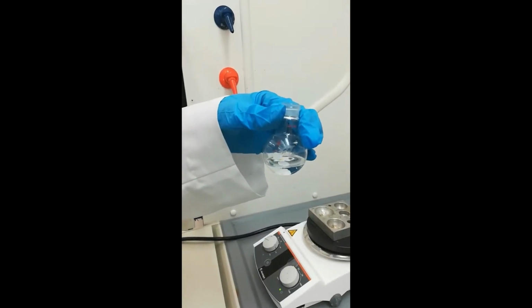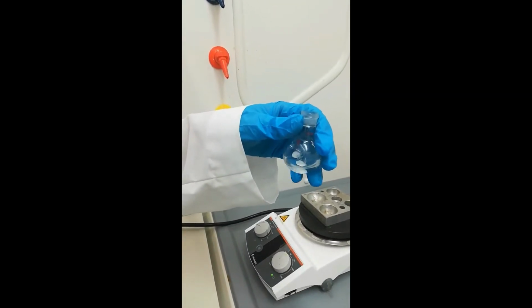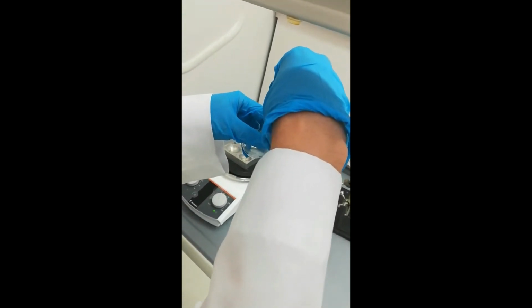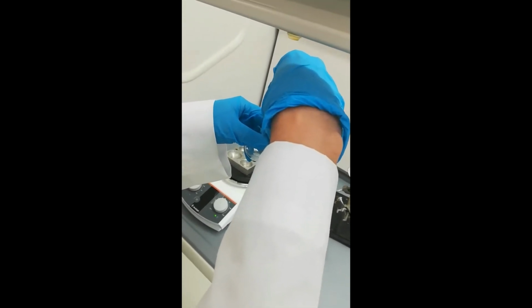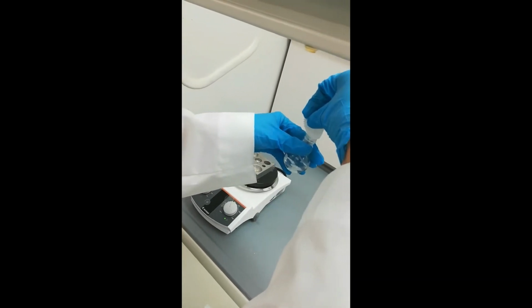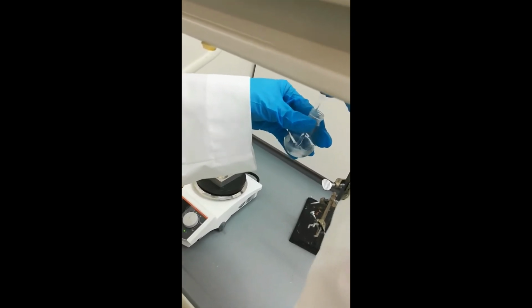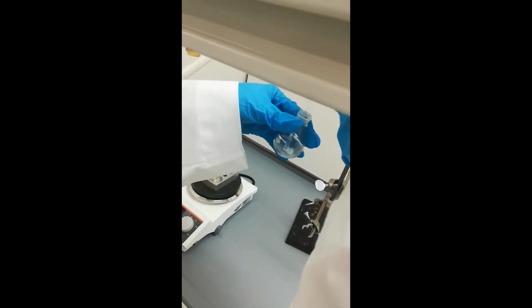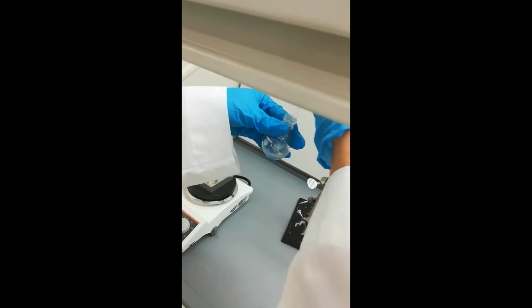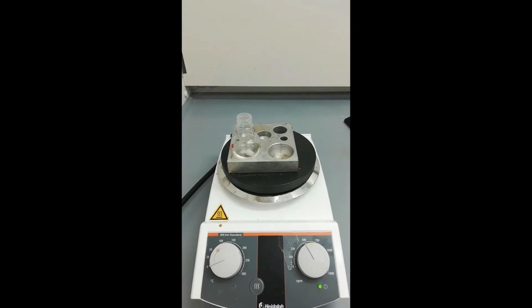When we come back to our reaction fume hood, by now all the salicylamide has dissolved in absolute ethanol, and we are going to add the sodium iodide that we just weighed out. Sodium iodide is being added to the round bottom flask containing salicylamide. Then we dissolve everything in the solution using a glass rod, and then the solution is stirred again using a magnetic stirrer.